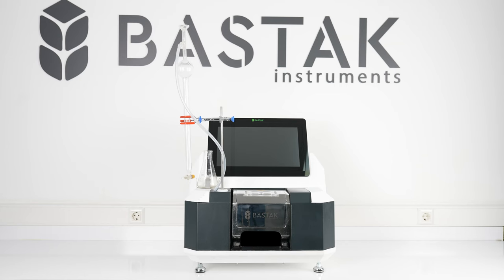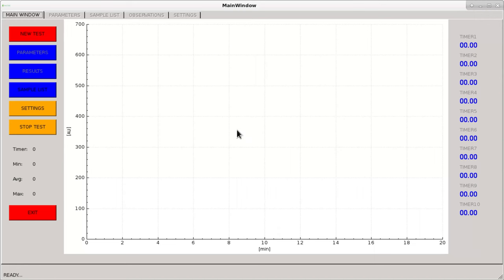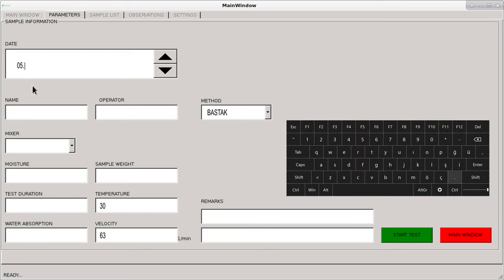The dough sample is prepared in accordance with international standards. For Absograph analysis, select the Absograph indicator on the touch screen and select the New Test indicator. The system automatically assigns the test date, though the operator can select a different date. Enter the sample and operator name.